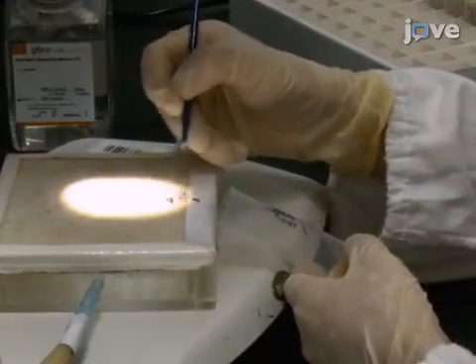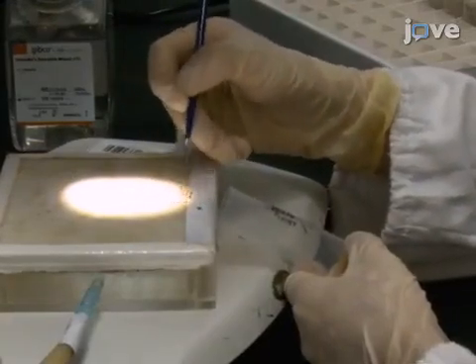Separately collect newly-eclosed males and females in three vials for each group per experiment, placing 10 flies in each vial.